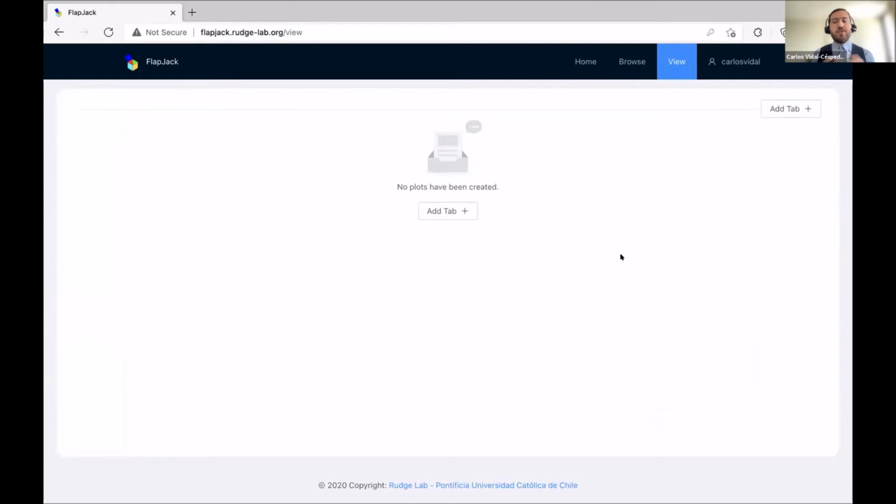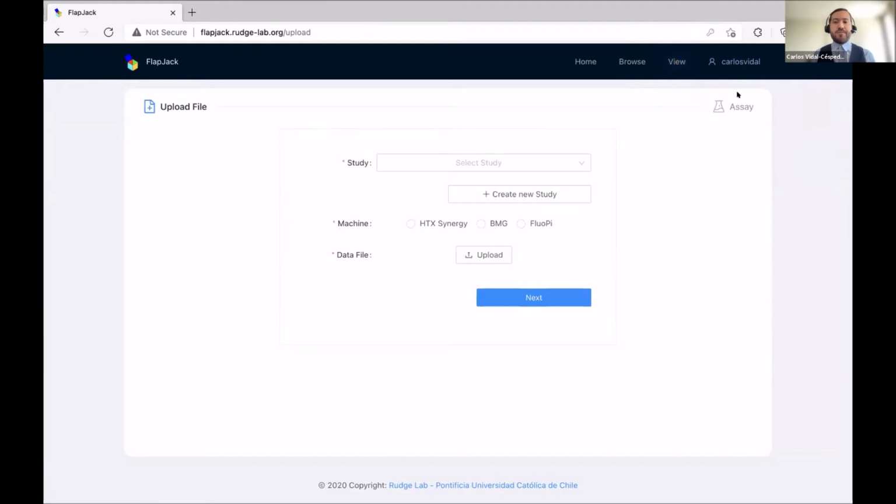So you have performed a study, right? So the next logical step for you is to upload it in order to see it. For doing that, we might ask you to download the zip file that we have shared on the Slack channel, because we are going to use that one. For that part, go over to your username, and this drop-down menu is going to appear where you can click Upload.